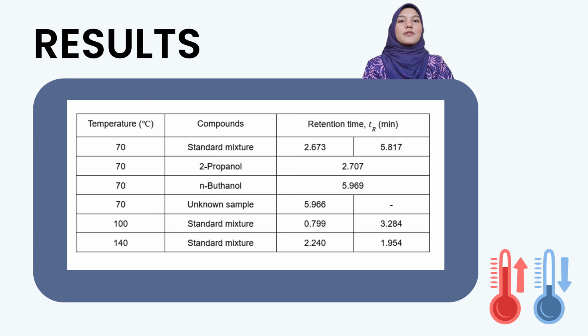Lastly, to observe the effect of temperature on retention time and chromatographic resolution, we can compare the retention times of the standard mixture at multiple temperatures, which are 70, 100 and 140 degrees Celsius. The data show that retention time decreases as the temperature increases.